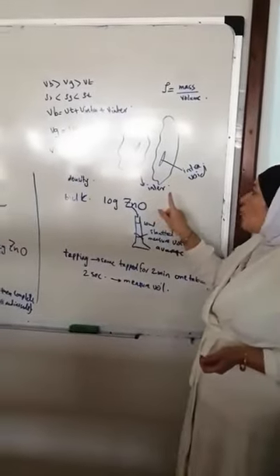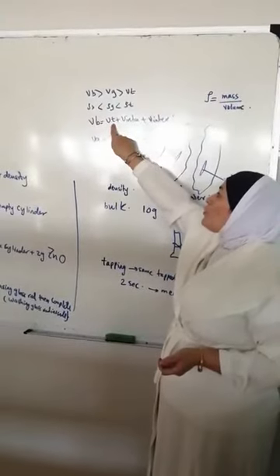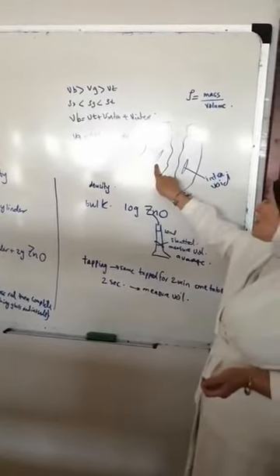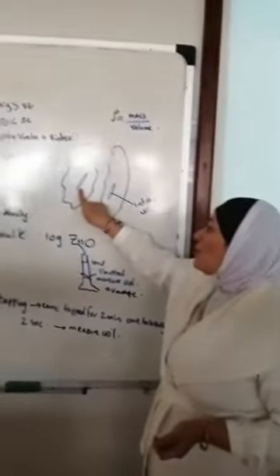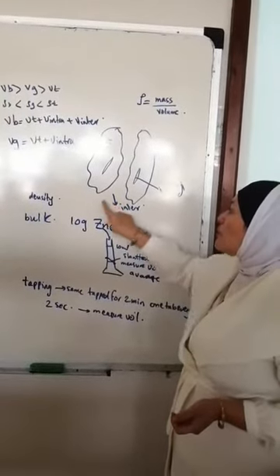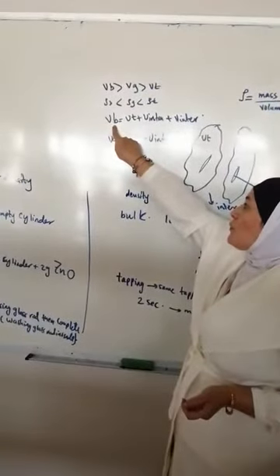We have three volumes. Bulk volume, which is the true volume of the powder, plus the volume of cracks or fissures inside, which is the volume of intravoids, and the volume of intervoids between the particles. So bulk volume is the largest volume.